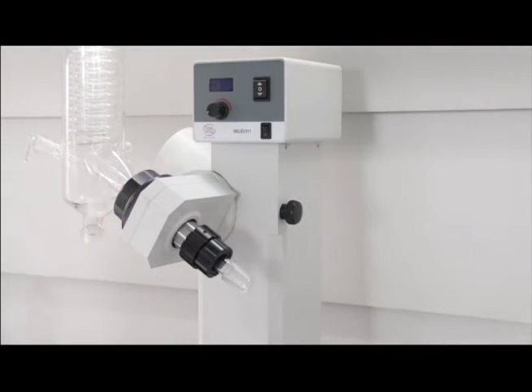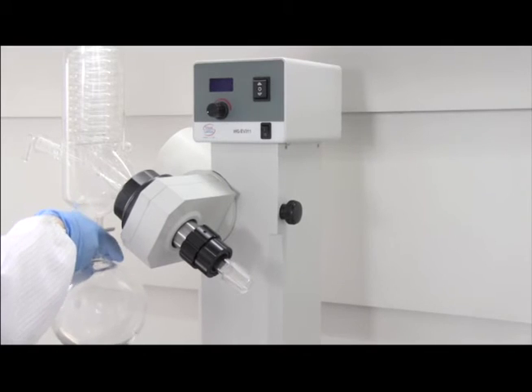Now that the condenser is vertical, we can move on to installing the receiving flask. The receiving flask has a round ball joint. Secure the connection with a metal clamp.